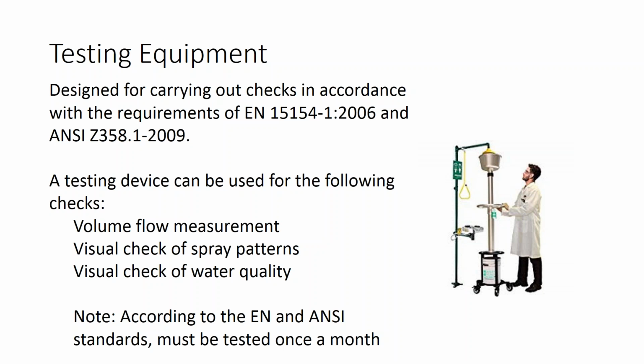I was recently at MIT, and the city of Cambridge, Massachusetts, has just instituted a requirement on all new facilities that they must be tested once a week, which is a pretty severe requirement as far as the H&S personnel and facilities.